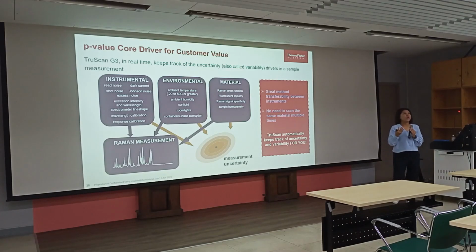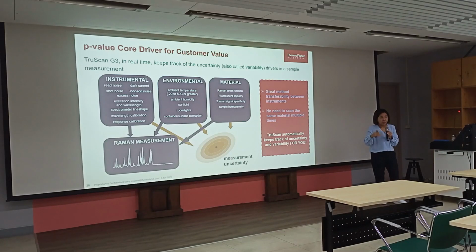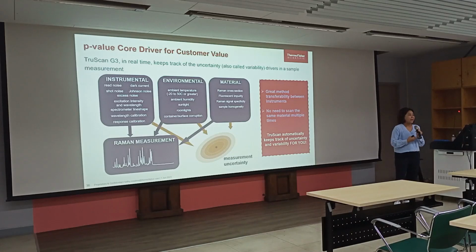Of course, maybe I have a different supplier, a different layer of packaging, different types of packaging material, maybe sometimes I use amber glass. You can put all these spectra with different packaging into the same method to make your method very robust. No matter what you scan through in the packaging, you will get a pass result. But not multiple scans. What I mean by multiple scans is one sample scanned 10 times to get the average. No, this is not the way.